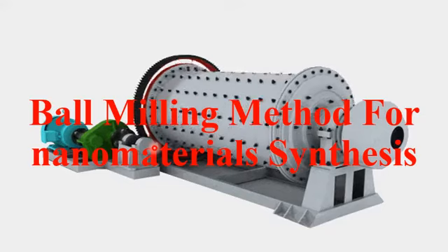Initially, the first foundation of the synthesis of nanomaterial was laid by a top to down method, known as ball milling or mechanical milling method for the synthesis of nanomaterials.